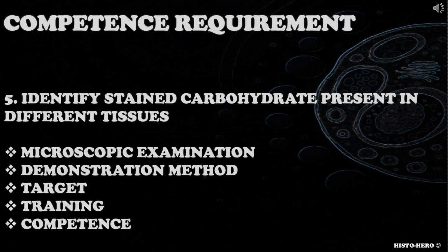The fifth competence requirement is for you to identify stained carbohydrate present in different tissues. What types of tissue express carbohydrates? How would you identify them? Consider microscopic examination of stained slides, demonstration method used and the target carbohydrate, your training and competence.